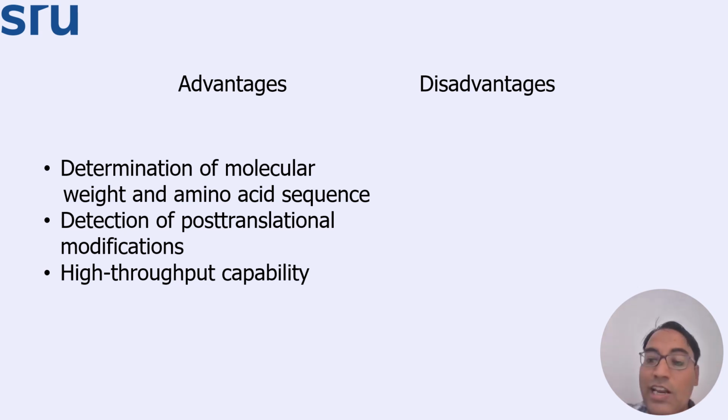Further, multiple proteins are often mixed together, which normally happens. In a cell, if multiple proteins turn up together, we get the protein fragments of all of them together, and we can easily detect all of these fragments at the same time, so that we can discriminate them further, that the current sample was a mixture of multiple different proteins.